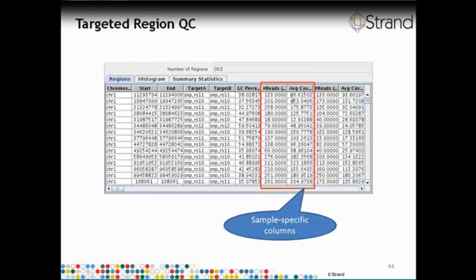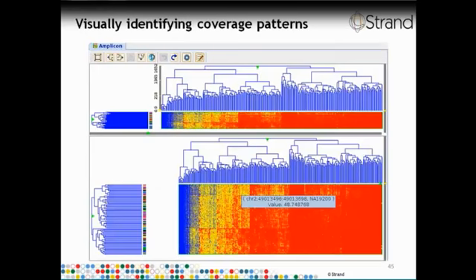So in this way, Avadis NGS helps you to filter through the large number of samples and SNPs that are generated by the MiSeq analysis software. We now move on to small RNA analysis. The MiSeq software quantifies the small RNA analysis results in the form of a file called hits.txt.